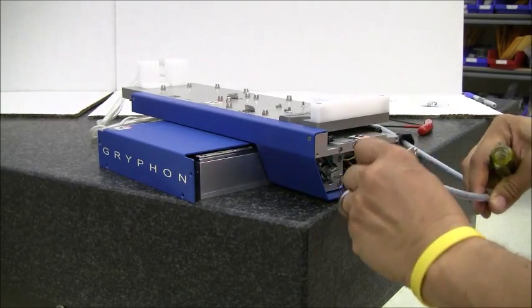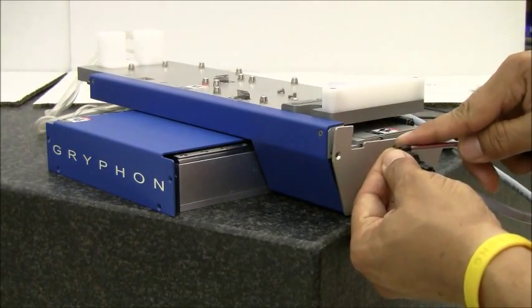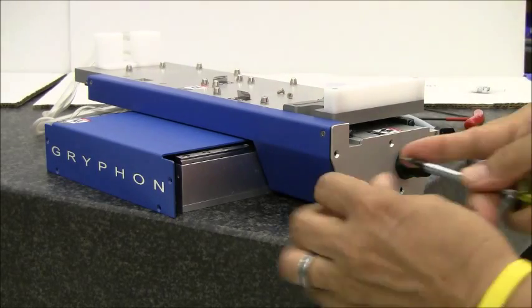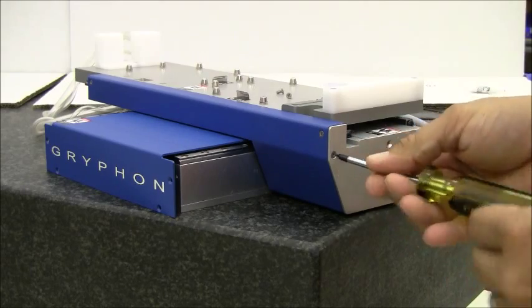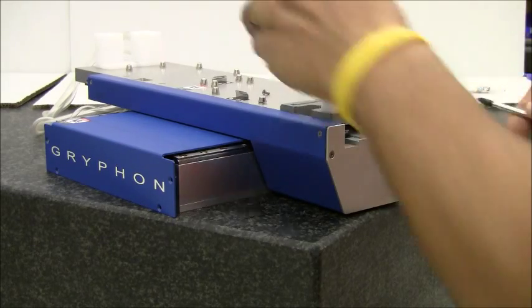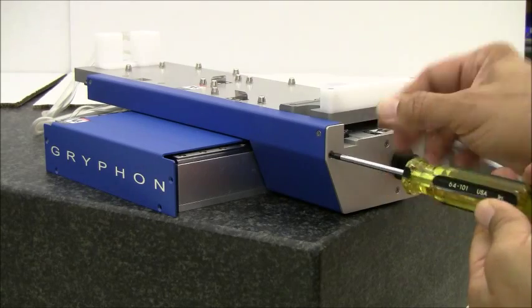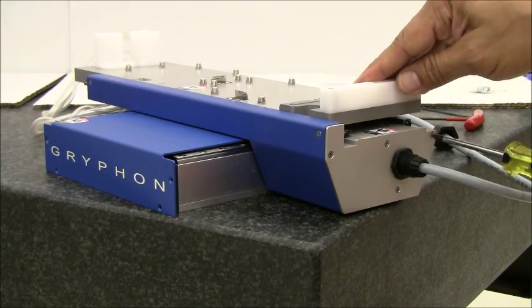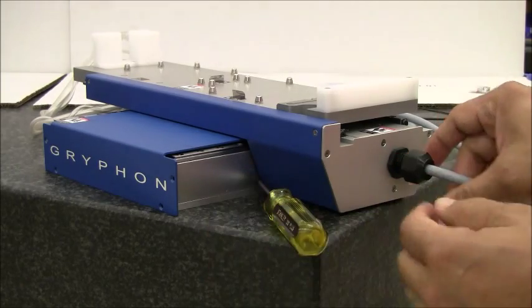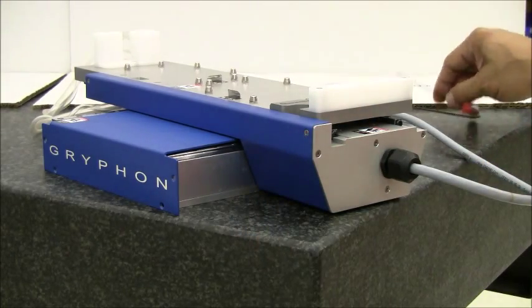Now you can slide in the side panel. Tighten the communication cable nut and you are done.